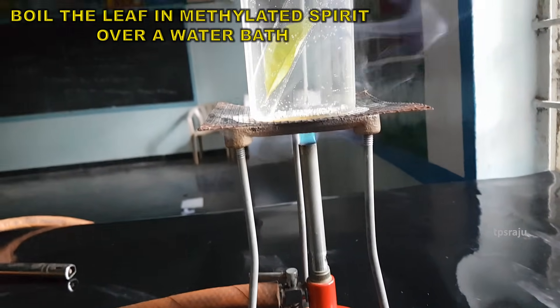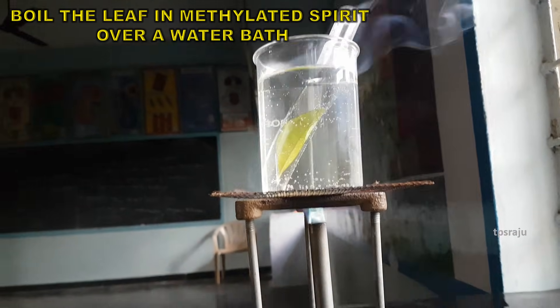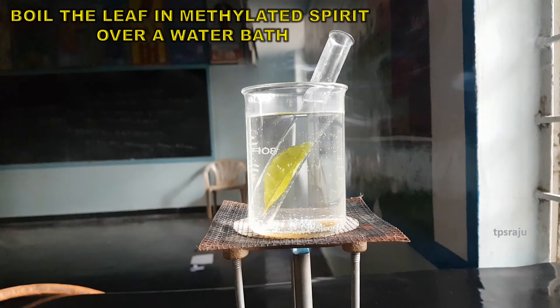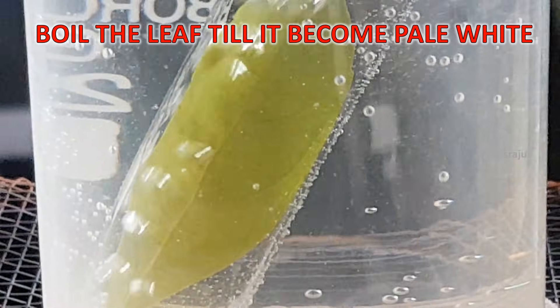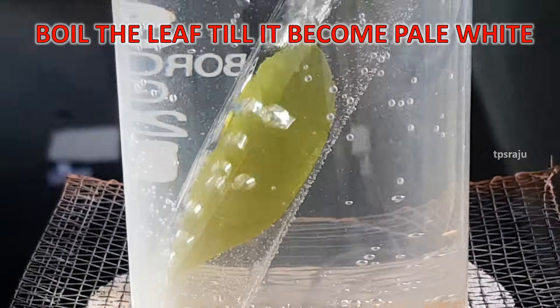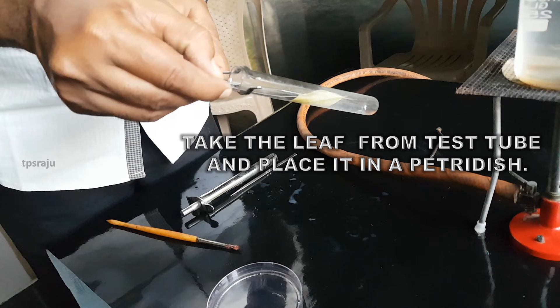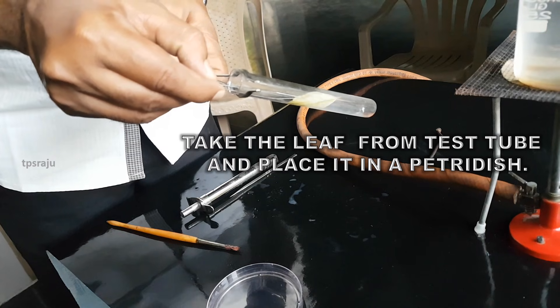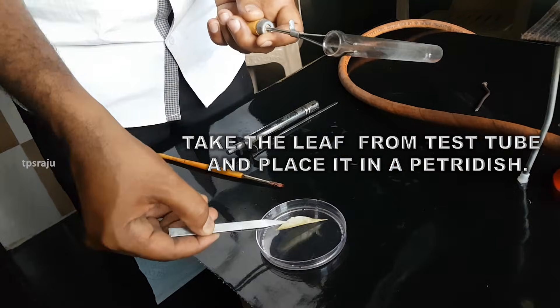Boil the leaf in methylated spirit over a water bath till it becomes pale white. Carefully take the leaf from the test tube and place it in a petri dish.